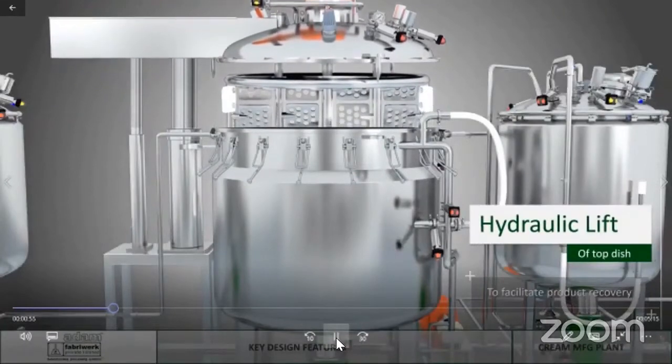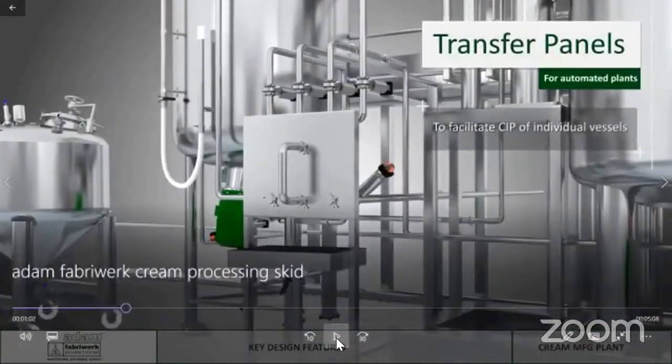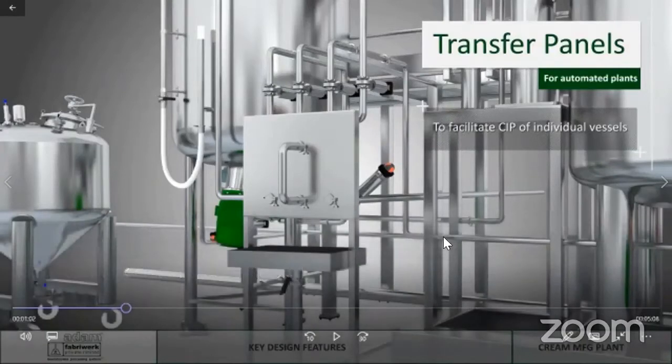There is hydraulic lifting for the top dish of the vessel to take the top lid up. There are transfer panels also to facilitate CIP of individual vessels. A transfer panel is a system in which lines are connected from the CIP and redistributed to different points within the vessel. The spray ball of each vessel - manufacturing, wax, water, as well as storage - is connected through the transfer panel. It is a fail-safe mechanism for cleaning in place of the process vessels, ensuring you can carry out batch operation within the vessel and CIP of the other vessel at the same point in time.